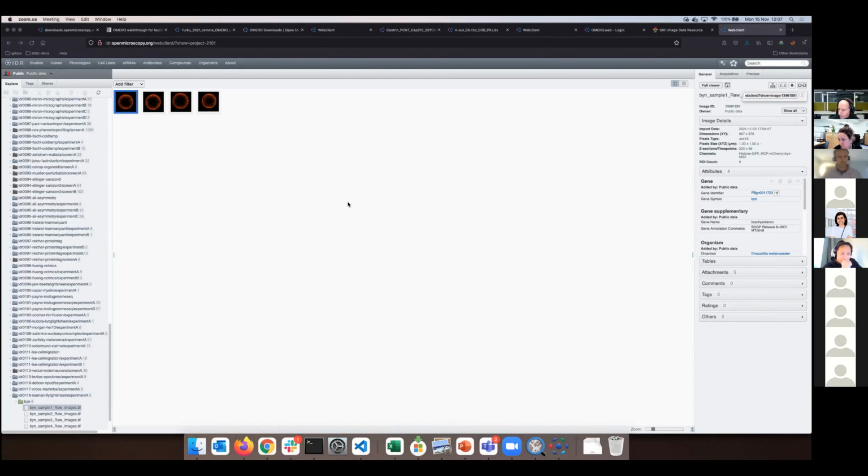IDR is fully public, but your Finnish Turku Omero server can be mixed. We also have a mixed server, meaning some groups are non-public, some groups are public. The public groups we know because they have a public user as a member there. Then you can go ahead and distribute the links, and the world will be able to see them. The other groups will not be able to see them because they are protected by credentials.